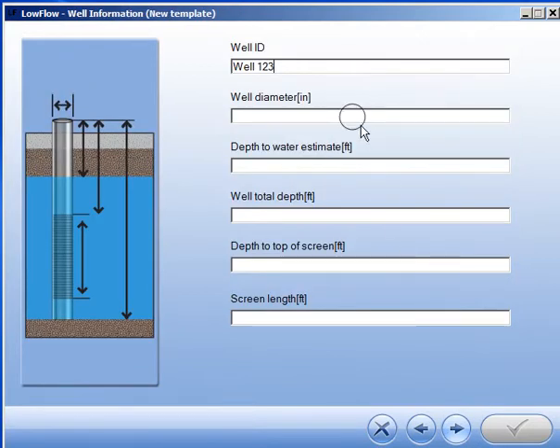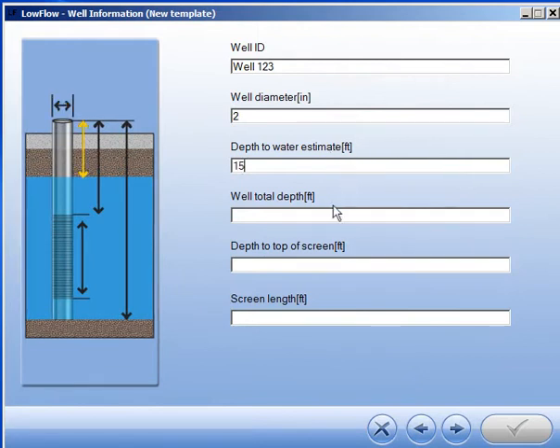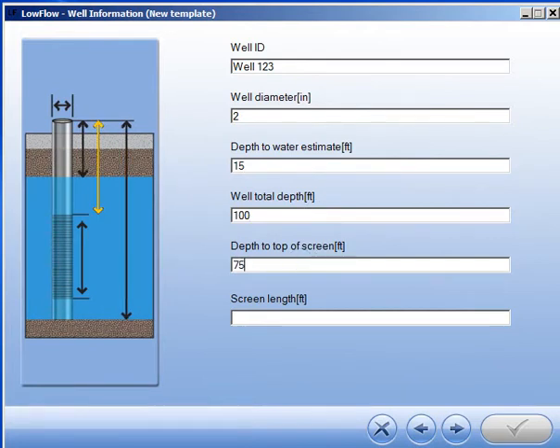This interactive screen allows you to enter the information about the well in which the low flow sampling will take place. When you click on a field, the graphic shows you the corresponding part of the well.